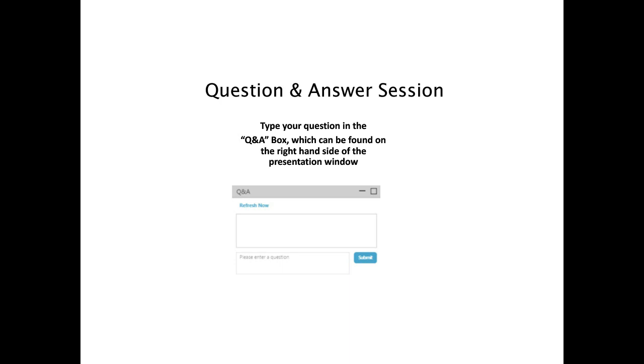Another question just came in. You have your detectors in series. Traditionally, there is a split flow between the RI and the viscometer. Have you tried this configuration, or is it not necessary? Yeah, so this is a great question. People have used both series detection and parallel detection. The advantage of parallel detection is that, in theory, you can get less broadening. The downside is it's very difficult to maintain the split ratio without having a mass flow controller.